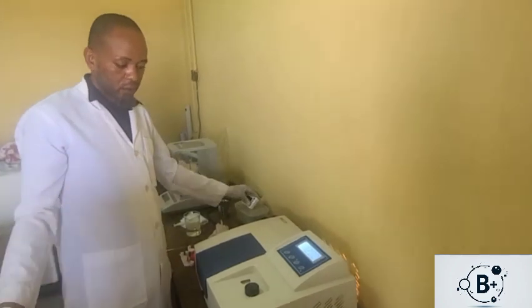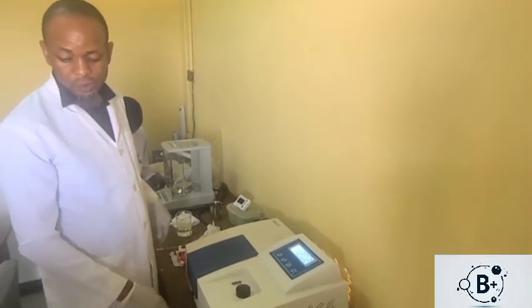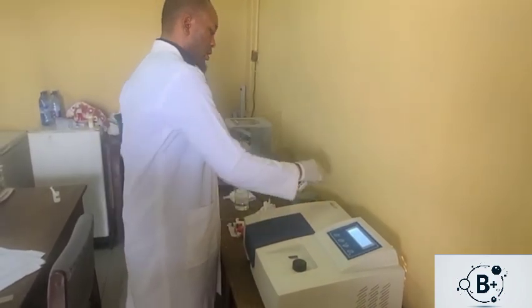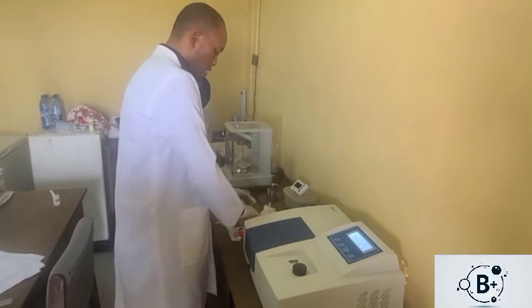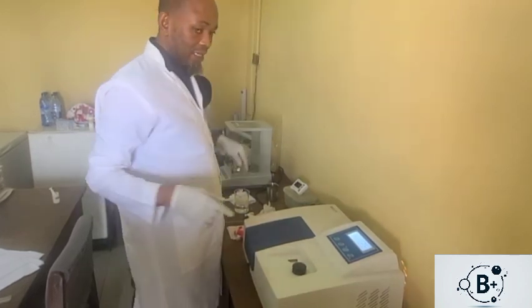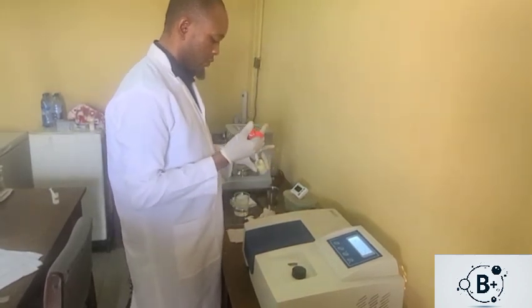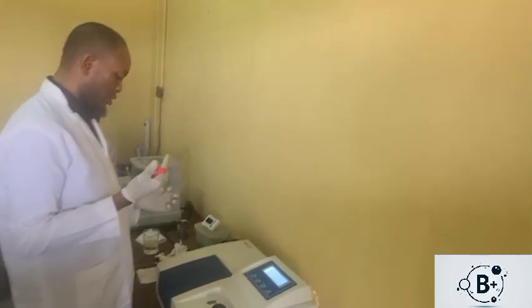Okay, so this 1200. That's the last one, right? Okay, so at the end of the first interval, which is 180, that is approximately 3 minutes. We change it, then we turn the quartz cuvette downwards to drain out the remnants of the analyte that has been used from the first sample. Then we get the first reagent ready. For this, for example, I'm using 150 microliters. So I add 150 microliters of the first reagent to it.